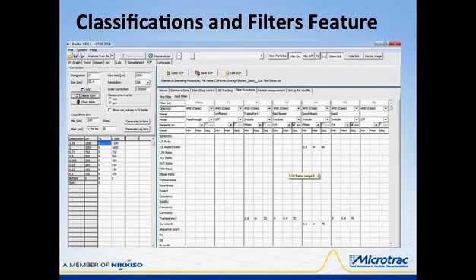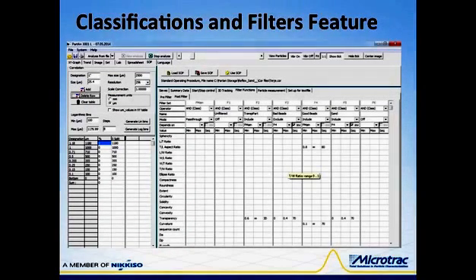We've looked at two ways to investigate classifications within a given analysis result, in the scatter diagram and more extensively in the View Particles display. Once pertinent classifications have been discovered using these methods, they can be permanently set up as SOPs, or standard operating procedures, that automatically create them whenever a sample is run using that SOP.